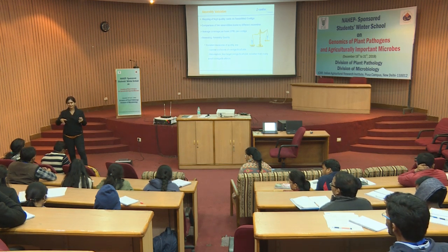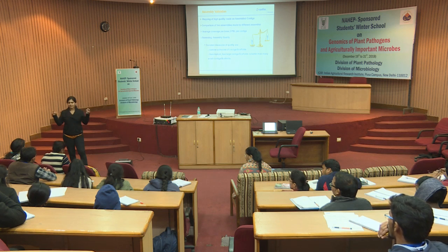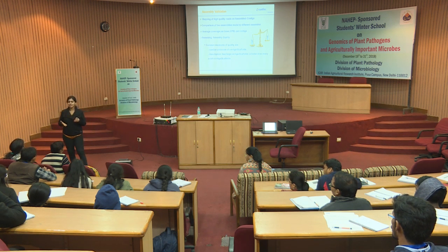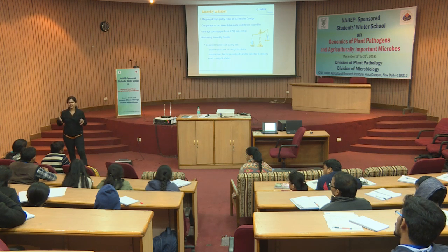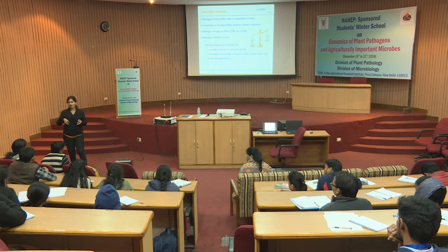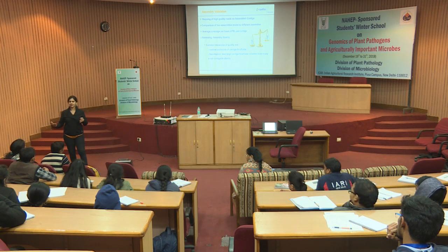That is a theoretical explanation, but the reads were not going beyond 2 kb, whereas they should reach up to 15 kb. So, my average read length was coming 1 kb or 2 kb max. That means the polymerase is just clipping off and the reads are getting chopped off. So, there is a chance that it is introducing something else. Usually what we see in PacBio is that they introduce indels, right. To correct these indels, we can use these other platforms.